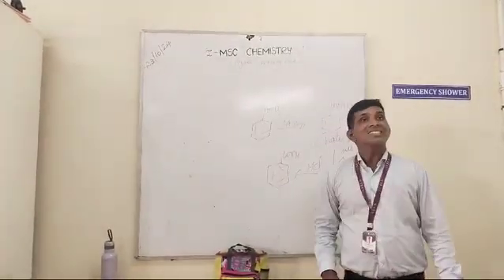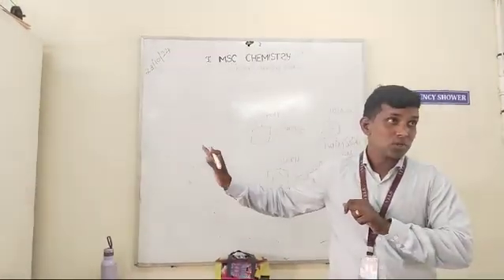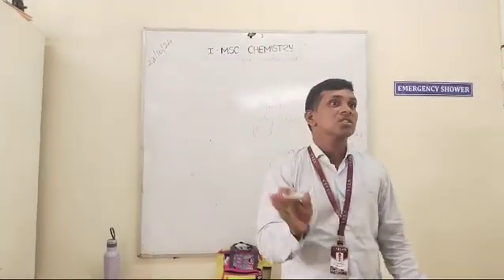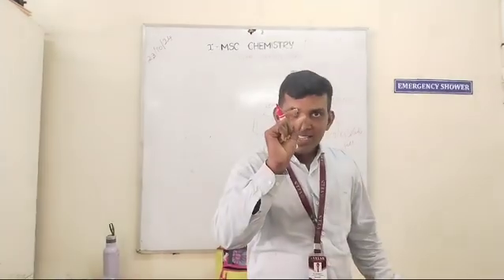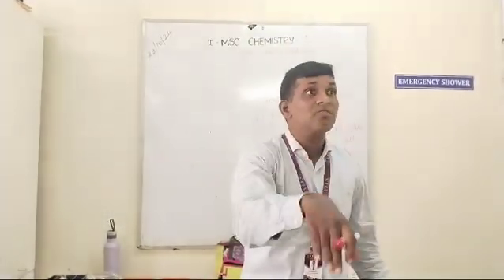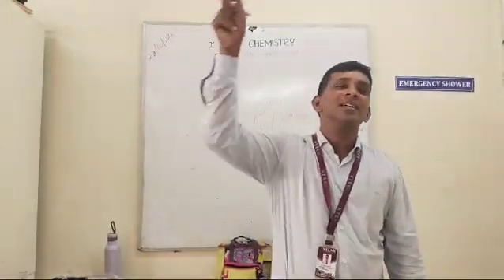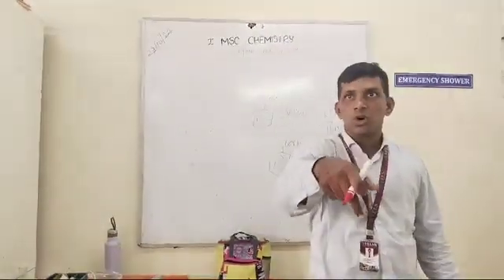Okay. Say in case there is no brisk effervescence, so there is no carboxylic acid, what do you have to do? Take sodium hydroxide. So definitely you will get what? In case it's a carboxylic acid mixture, you will get a soluble part and a non-soluble part. In case of the absence of carboxylic acid, you get an entirely clear solution, full solution only. To that solution you add sodium hydroxide, in case the compound contains phenol.